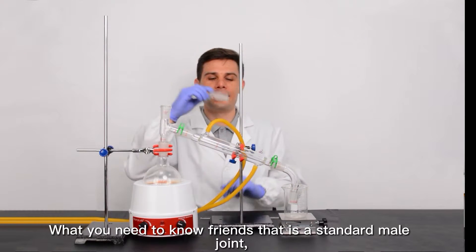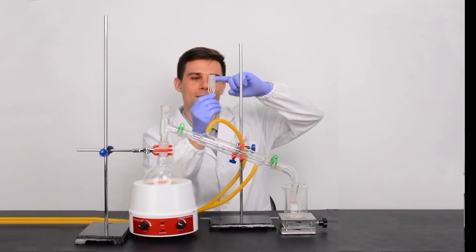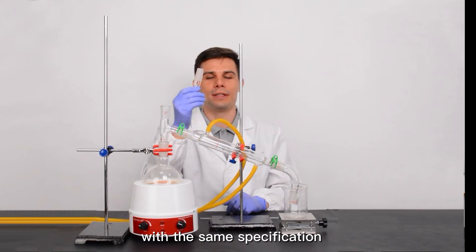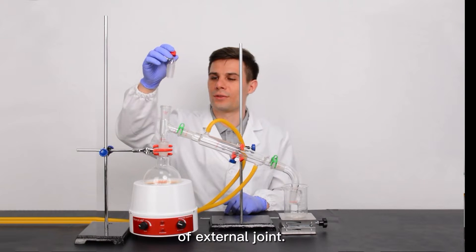What you need to know is that it is a standard male joint, and it's suitable for any equipment with the same specification of external joint.